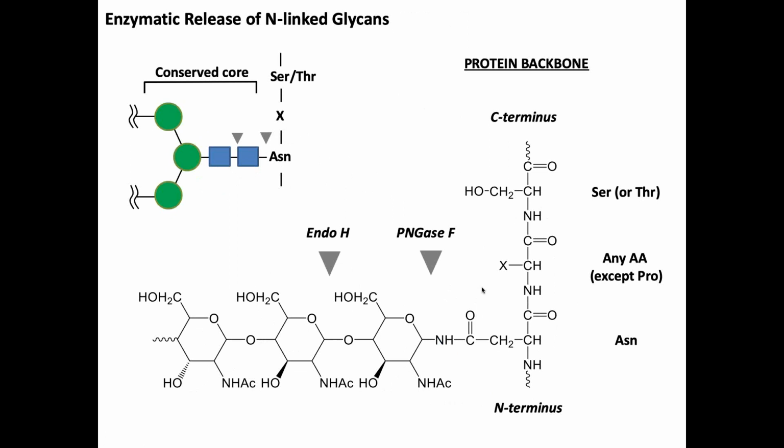But to his point, I don't know where else you might find the same motif or sequence, the carbohydrate sequence, that could give you trouble. And so is that a unique set of sequences that it only recognizes, or does it also have to have the protein involved as well? I don't know the answer to that. So what's the benefit of using those two enzymes, cleaving on one side versus the other? Well, one thing you could do is take endo-H and use it and leave the residue.